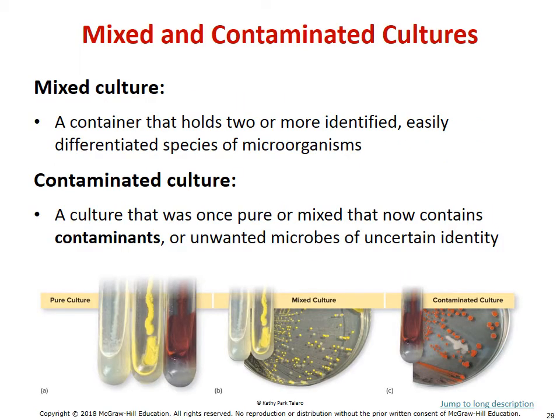So you can see here there are differences in appearance in terms of mixed cultures and contaminated. A mixed culture may be purposeful, but notice whenever we see it growing on a solid here that there's roughly equal distribution of the 2 different microbes. So there's roughly the same amount of yellow and gray here.